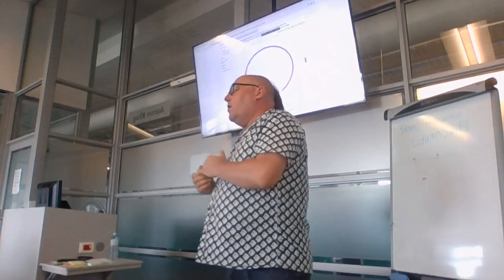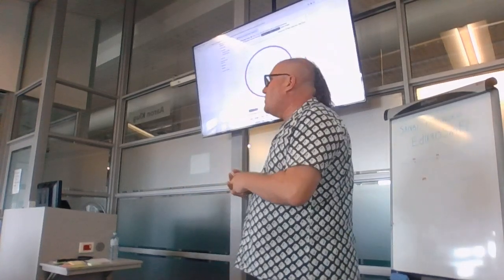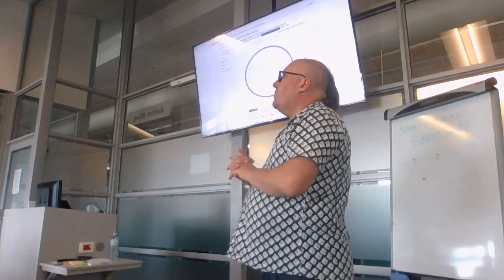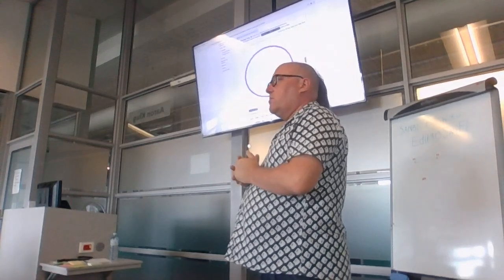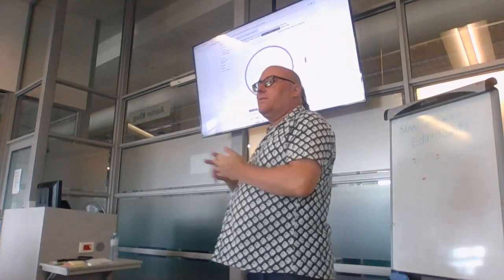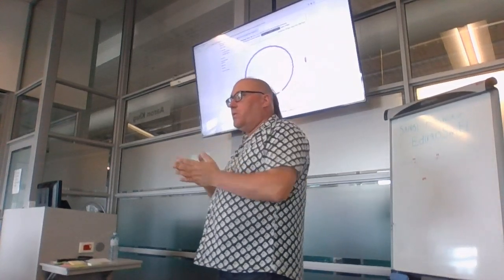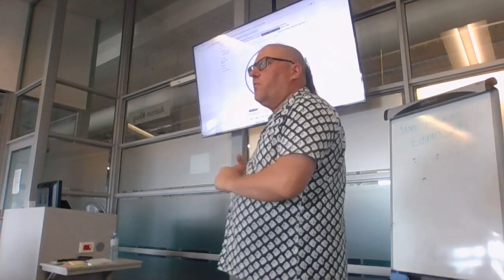The other thing is, how much do you need polishing? The latest results from Ryan are showing that genomes can get to less than 20 mistakes in the whole genome at this point with the latest nanopore data. Okay, I think he was using a Klebsiella genome for that.